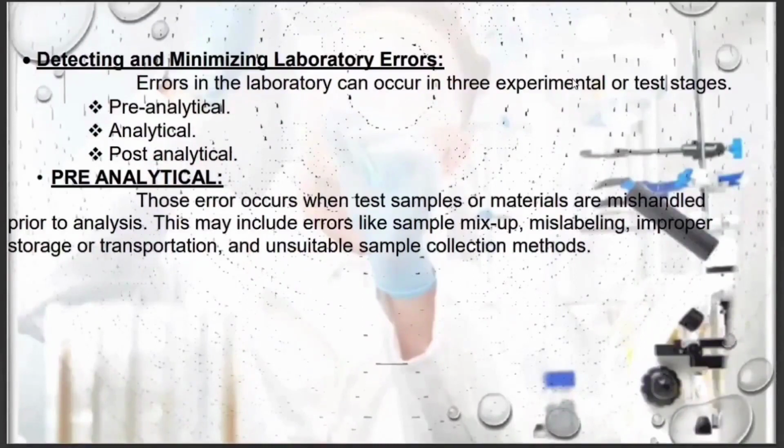Samples that might undergo degradation could lead to false results. It is advisable to always carry out subsampling. Storing aliquots of test materials provides backup in cases of errors in downstream processes.